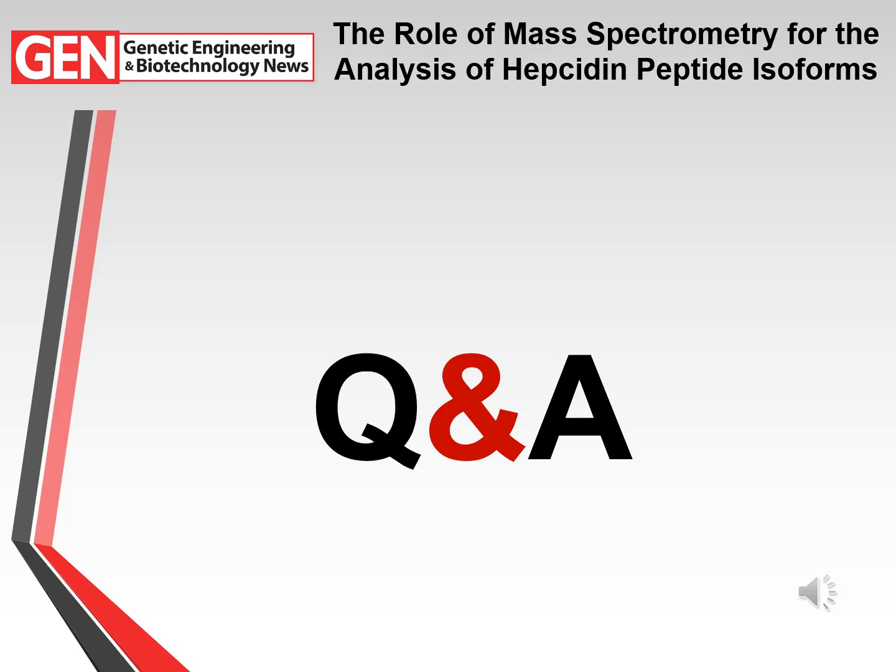But the complete analysis for the Ironman group, we're doing full LCMS analysis. So we're doing reversed phase, positive and negative. We're doing HILIC positive and negative, and we're doing lipid positive and negative as part of that analysis, so that we'll get very, very broad coverage of the metabolic profiles for all of these patients.